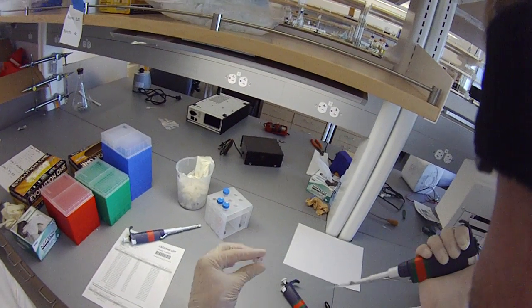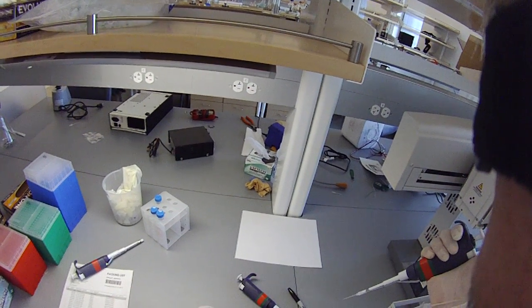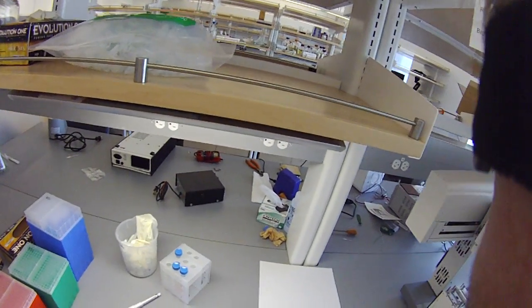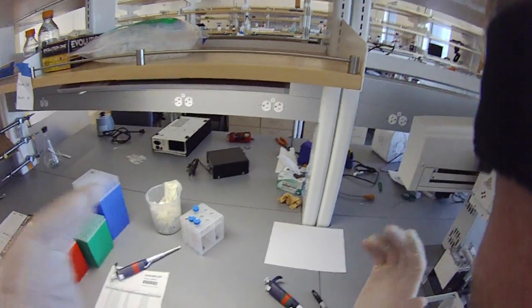I just pipette it up and down so that I don't have to shake it — that'll be sufficient mixing for this. So now we just need to do the 10 microliters. Good.